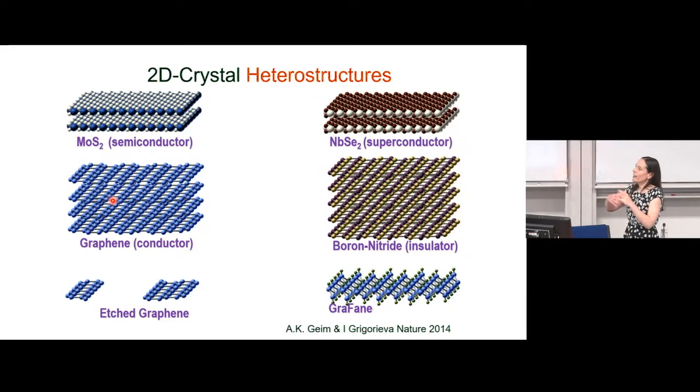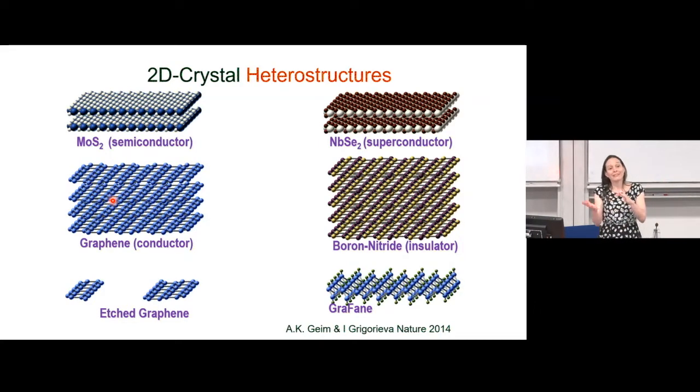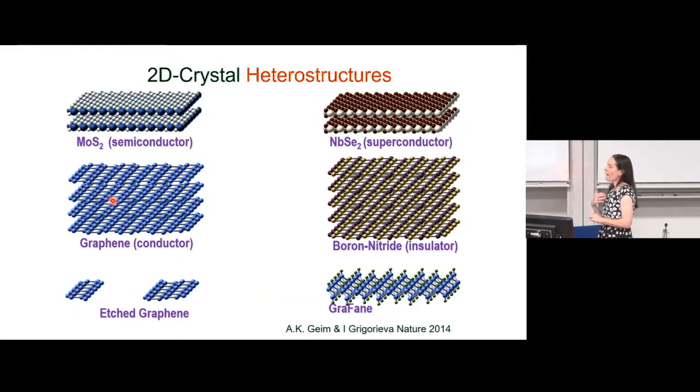And so they can effectively create a designer electronic device by peeling with sellotape and different colored pencils representing the different crystals, peeling those off and sticking them back together. So this is the basis for creating a more engineered, a more controllable liquid cell.